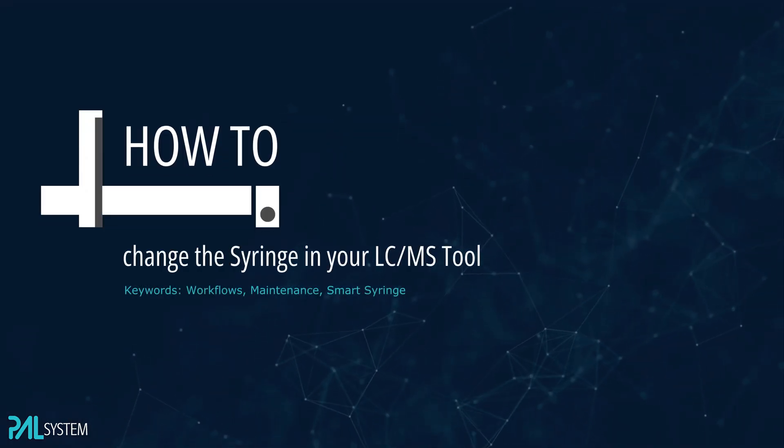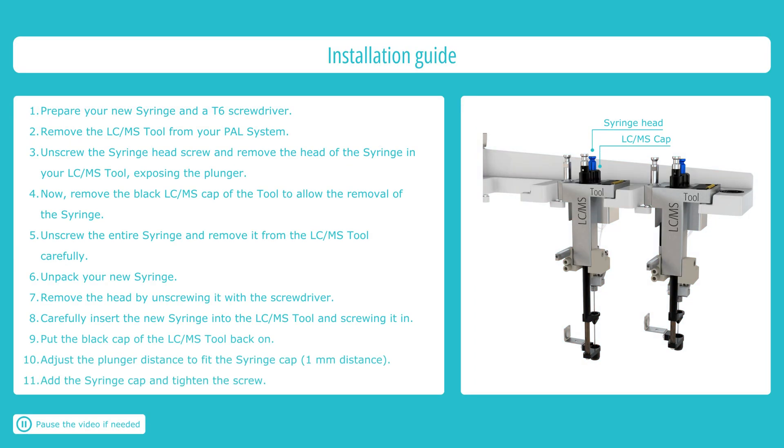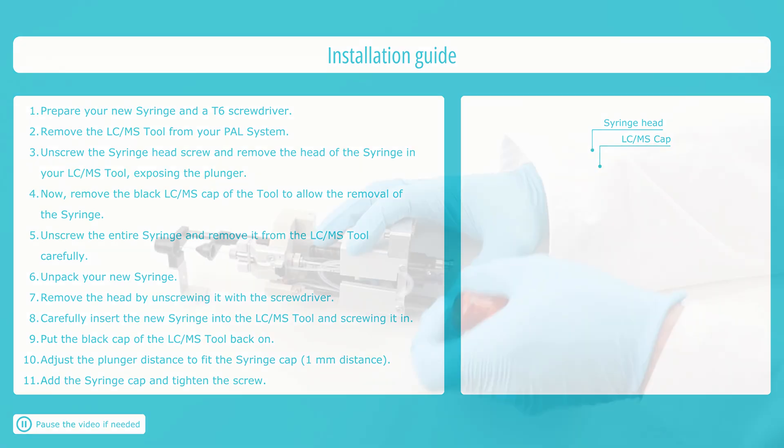In today's video, we will show how to install a new syringe in your LC-MS tool. To begin the syringe exchange process, gather the necessary tools: a new syringe and a T6 screwdriver. Please remember, as always, wear your personal protective gear and work on a clean and dust-free surface.